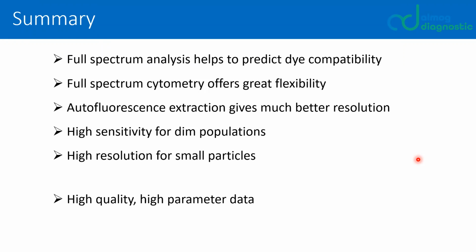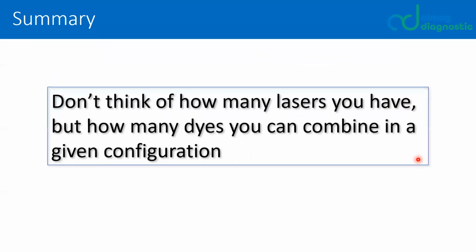And don't think of how many lasers you have, but how many dyes you can combine in a given configuration.